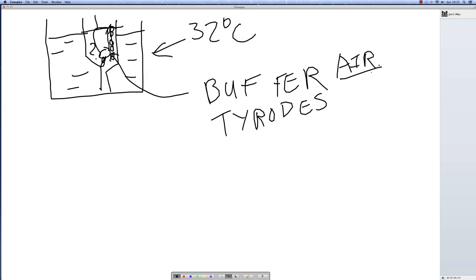No, it isn't. When you are bubbling it with air, you have got 20% oxygen that you are trying to dissolve into that buffer to give enough oxygen to that tissue. Do you actually think that we can dissolve enough oxygen in a liquid, in water, to keep the tissue happy? If you think about it again, the answer would be no, you can't.